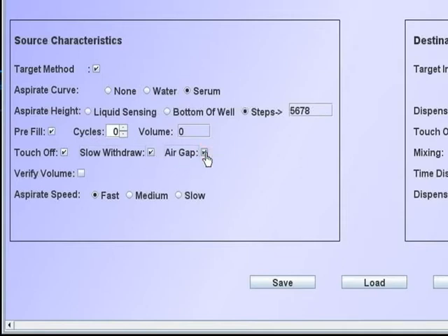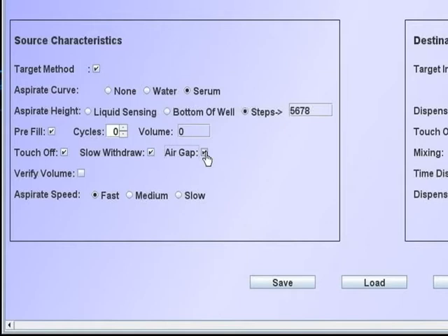If air gap is checked, a 5 microliter air gap will be automatically aspirated after the tip reaches its top Z position prior to moving. The volume of the air gap is set in the parameters.